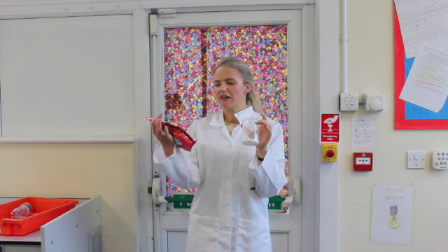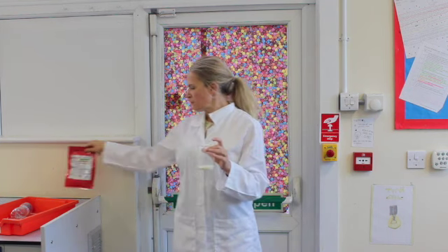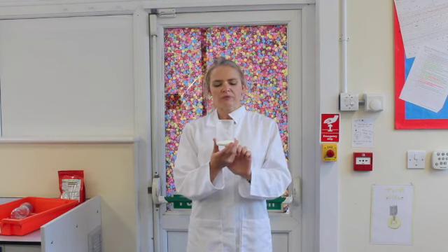Today we're going to do an experiment into rates of reaction. I've got here a beaker of some really ordinary dried skimmed milk powder, not particularly exciting. Now if I was to take a flame to this, as it is in the beaker, not very much would happen. It might char a little bit, but nothing else, because there isn't much surface area to react.